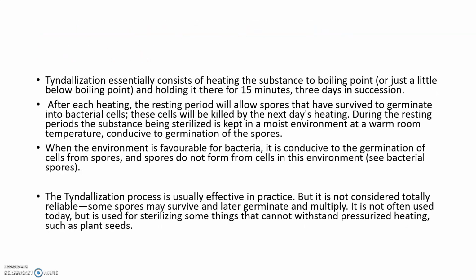It consists of heating the substance to boiling point or just a little below, held for 15 minutes on 3 days in succession. After each heating, a resting period is allowed. This allows the spores that have survived to germinate.